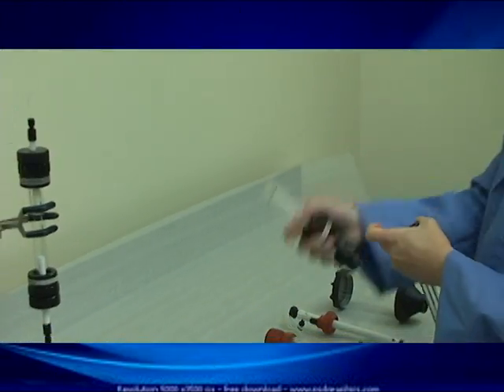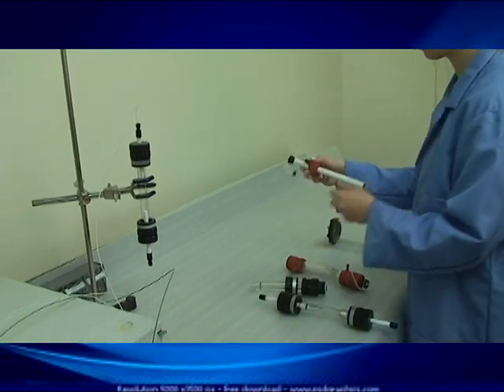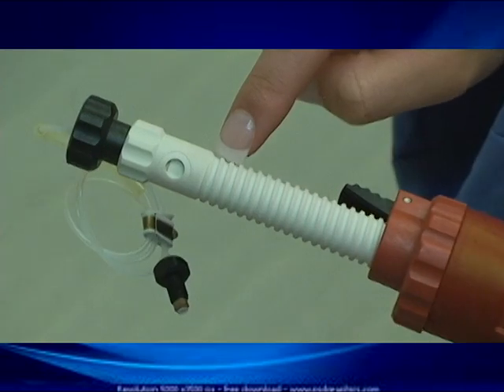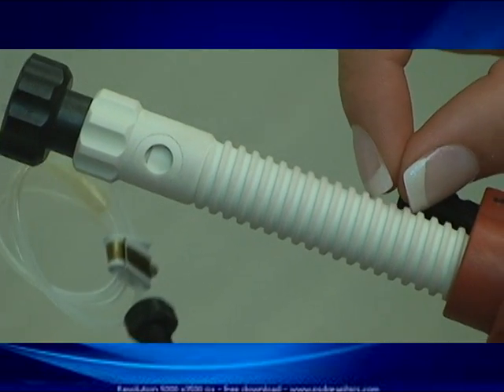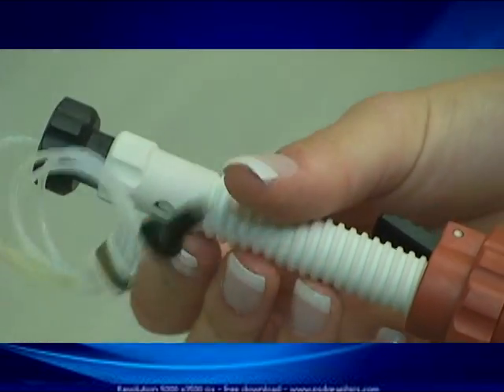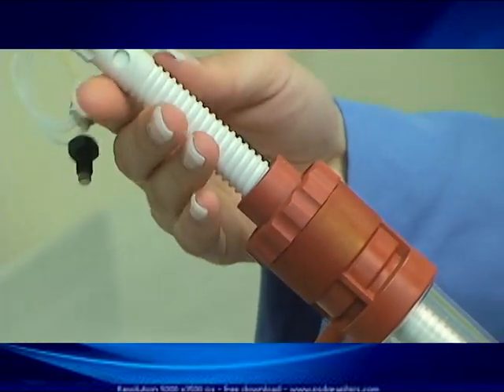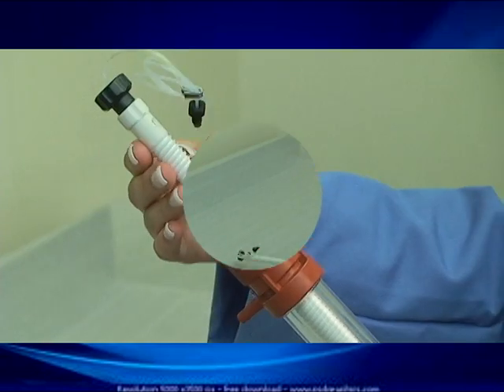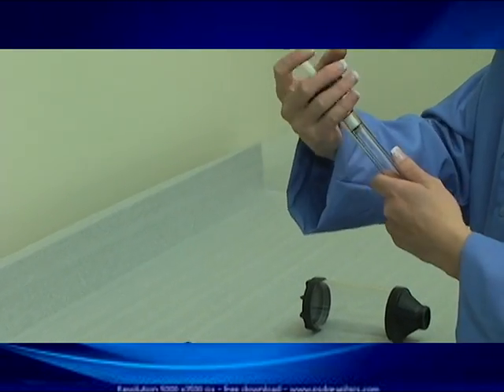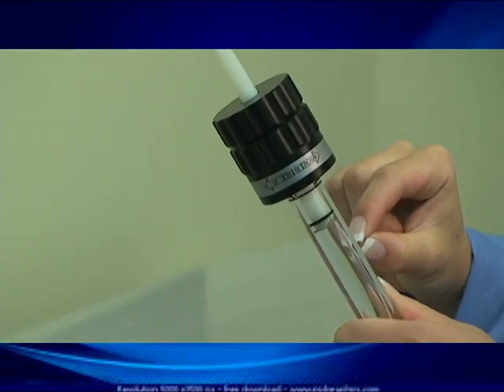Another item to point out is that the comparative column has a coarse thread on the piston. The coarse thread is cheaper to manufacture, making the column less expensive to produce; however, for every turn of the piston there is a much greater linear movement into the packed bed, not allowing for fine adjustment of piston position. With our ELS columns, we have used a machine thread with a much finer thread pitch, so with every turn of the adjustment knob there is a much finer adjustment into the packed bed, allowing the scientist to more accurately position the piston.